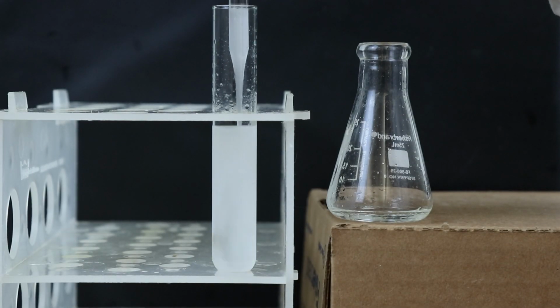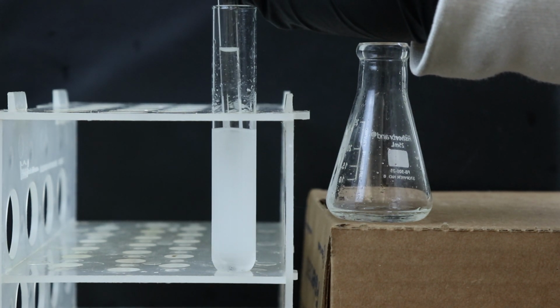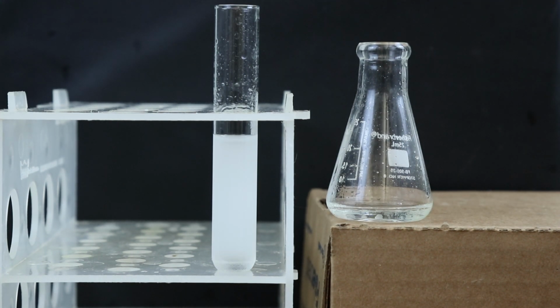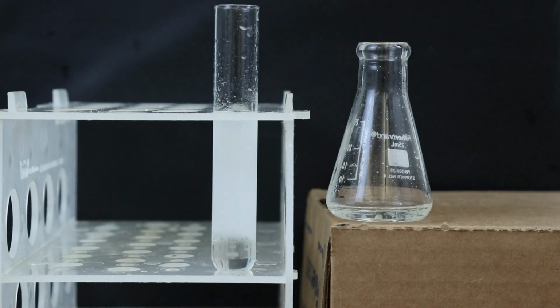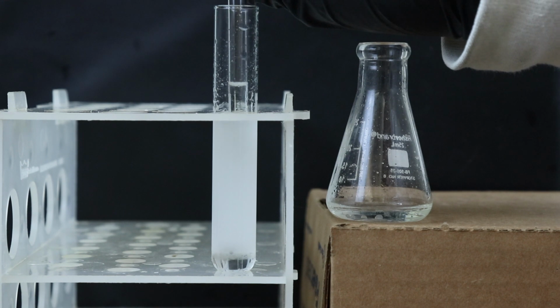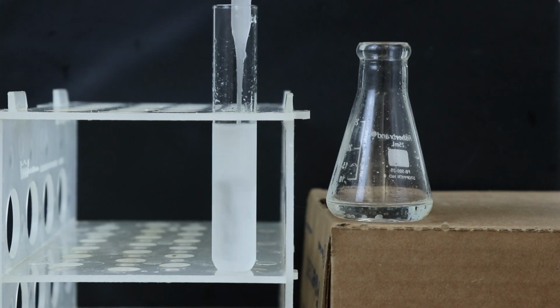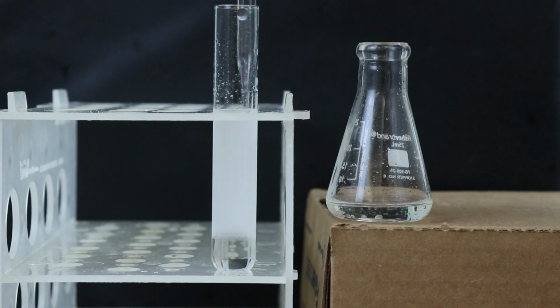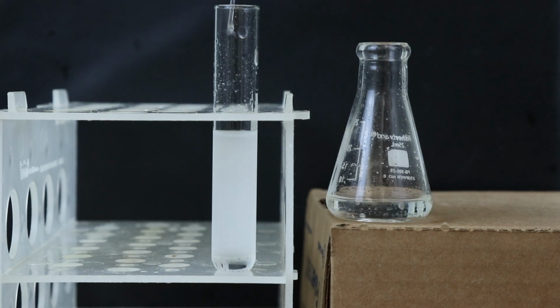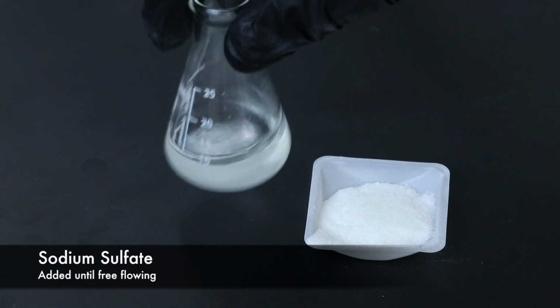Now I'll continue with the extractions, adding methylene chloride, mixing the two phases, and transferring the organic layer to the Erlenmeyer flask, and I'll do this a total of 3 times. Once the extracts have been gathered, I'll dry that organic phase over some sodium sulfate, and I'll add that until it's free flowing.